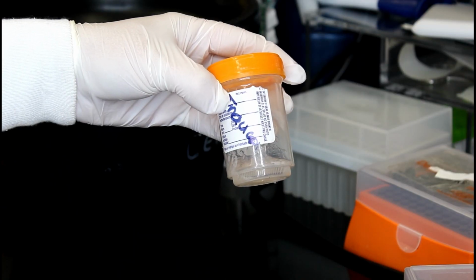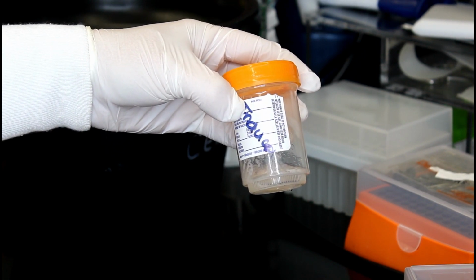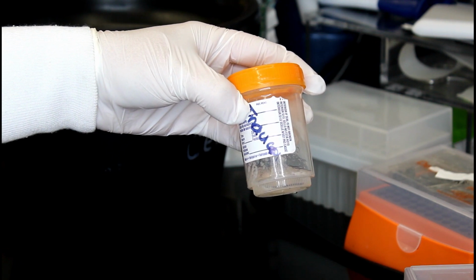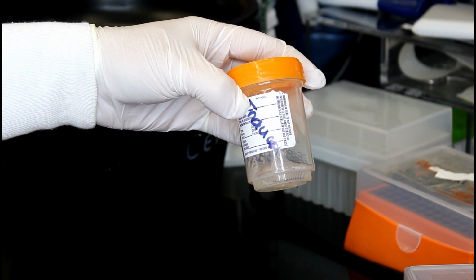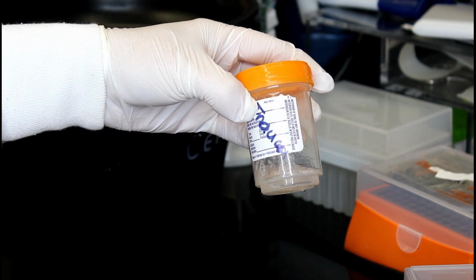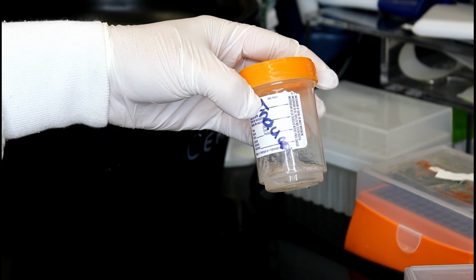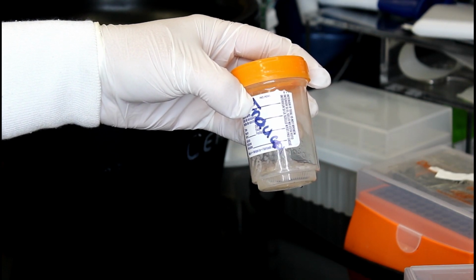To begin with, sputum samples will be processed according to the initial weight of the induced sample and whether a spontaneous sample was acquired prior to the induction. There are 5 conditions to consider based on these 2 parameters. Condition 1, you have greater than 1 gram of induced sample. Condition 2, you have between a half a gram and 1 gram of induced sample.